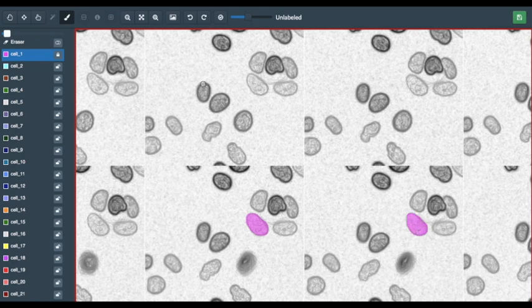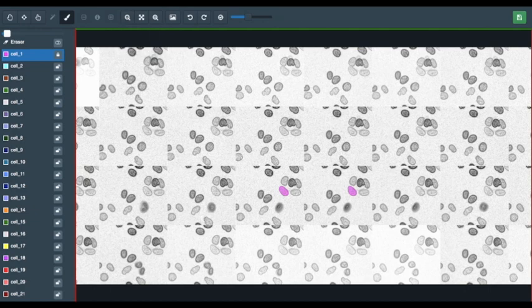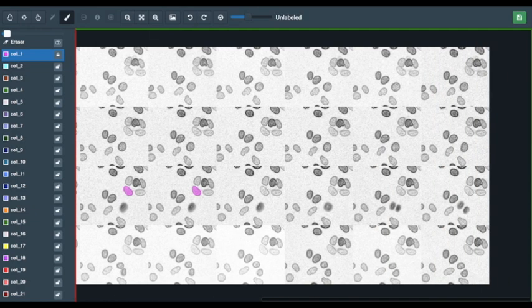If a cell disappears by moving out of the image, like here, or dividing into two new cells, like here, don't use the color that you used for that cell for any other cell. In a similar vein, new cells should be colored with colors that haven't been used yet. Even if you think a new cell is just the return of a cell that had disappeared previously, stick to the safe side and label it with a new color.